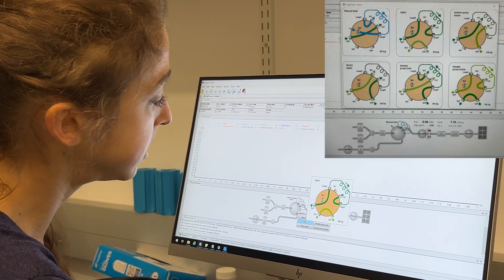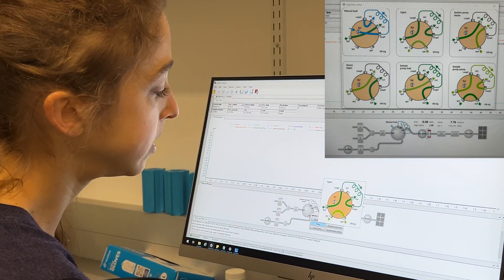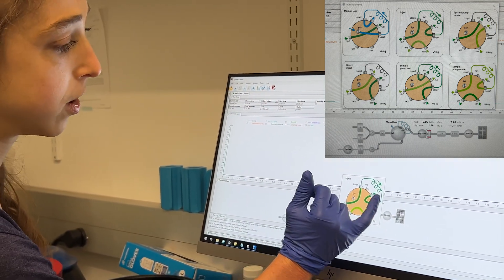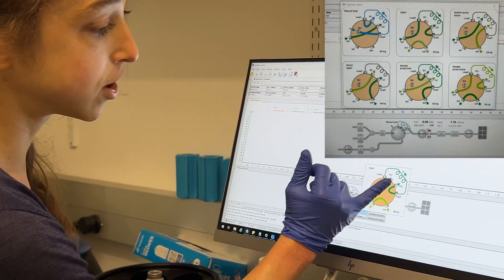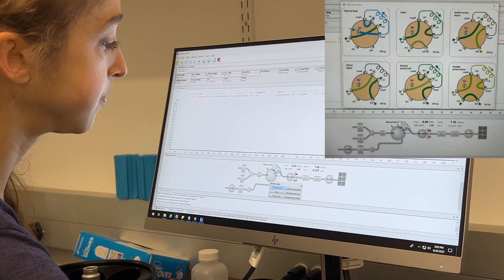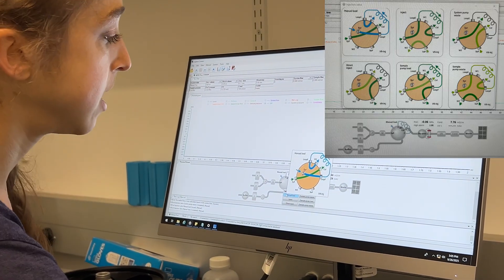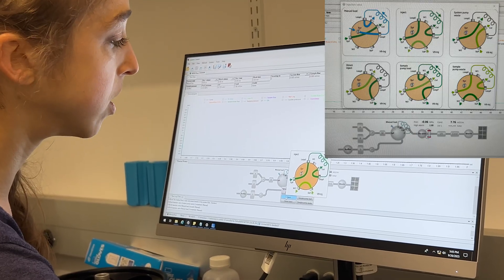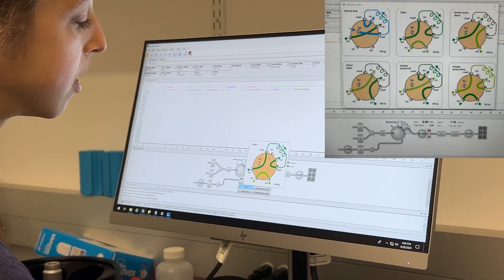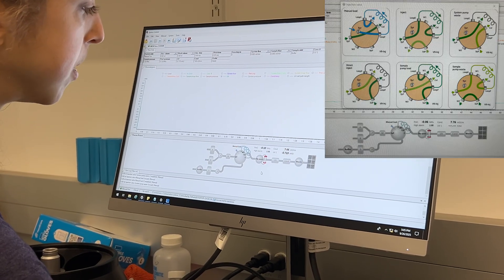We were in manual load where we're adding from the syringe into the loop. When it goes to inject, it's adding from the system pump, which is going to have our buffer through the loop, and then it's going to go onto the column. Whereas in manual load, it was going into the waste extra. When we have inject, it'll go onto the column — not directly from the syringe but from the system line. But for now we're setting it to system pump waste.